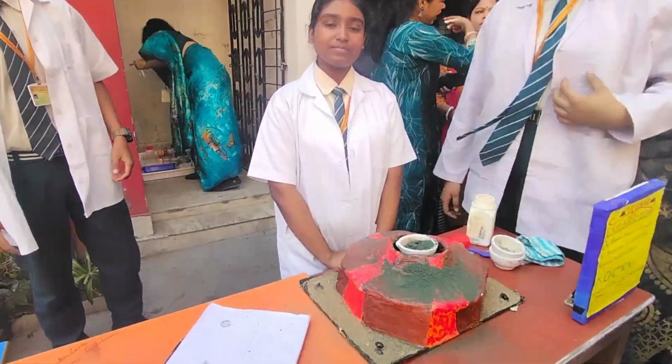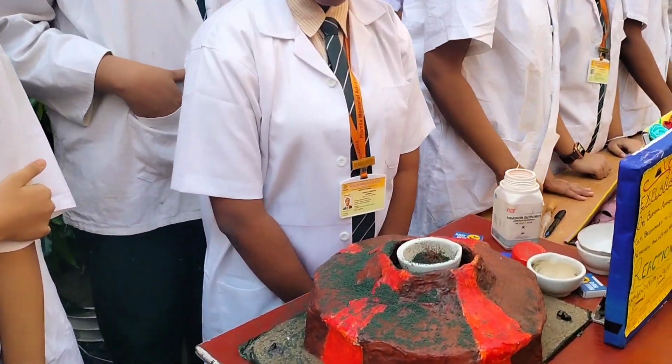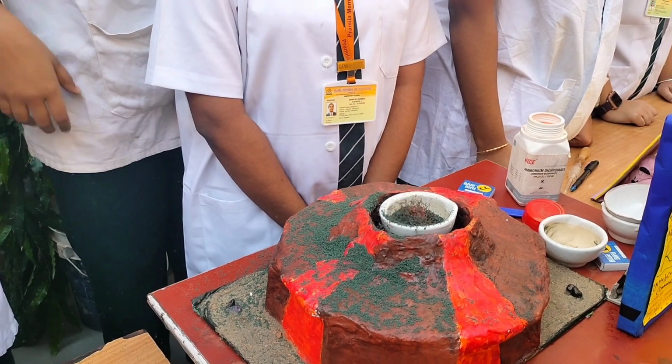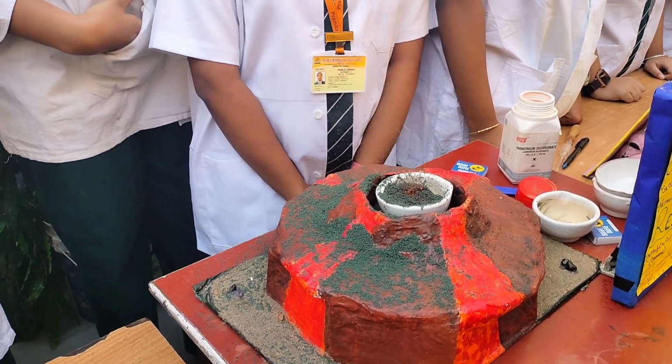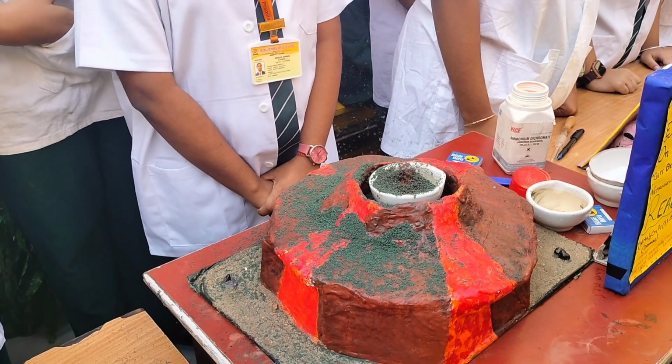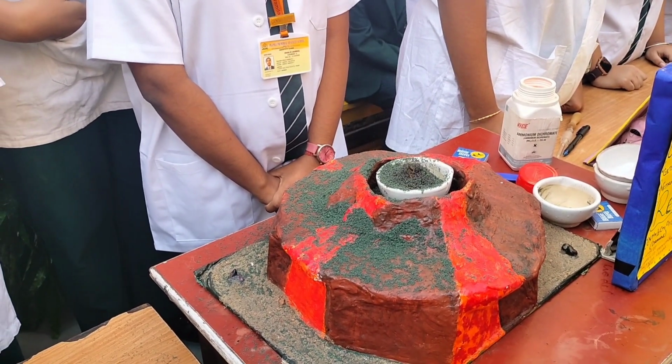In a ceramic bowl we are taking ammonium dichromate. On burning ammonium dichromate with the light stick, it gets decomposed with sparks to form a green colored substance, that is chromic oxide. The gas evolved is nitrogen gas and water vapor.